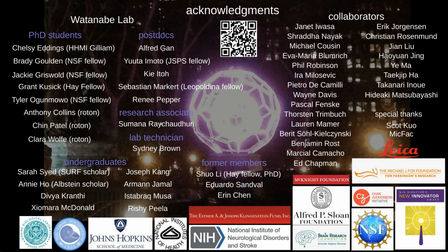You can use any type of cell, and can you get beautiful images from every type of cell? This is an interesting question because it really depends on the users. You have to practice loading and handling the samples in order to get beautiful images, and it takes quite a bit of practice. But once you get used to doing the freezing, this technique is going to work, and you can always get good images.